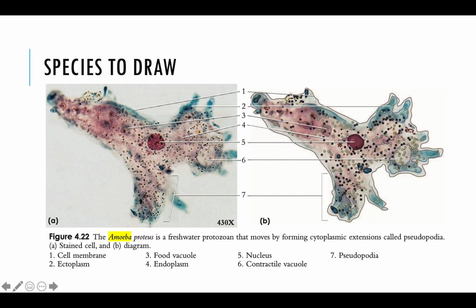So you'll need to draw an amoeba. I don't think it requires you to label anything. Just make sure you draw it.